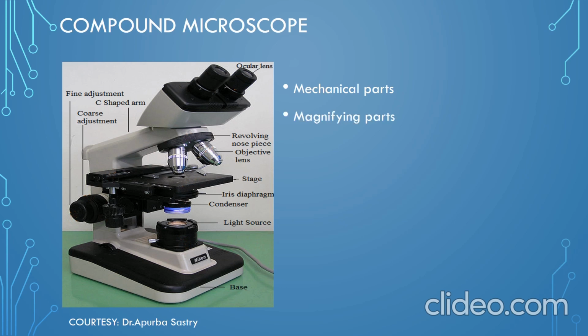So what is the principle behind this light microscope? In light microscopes, the rays from the light source pass through the iris and fall on the specimen. The light rays are gathered by the objective and a magnified image is formed at last. So the magnified image depends on your magnification power and the ocular lens power.